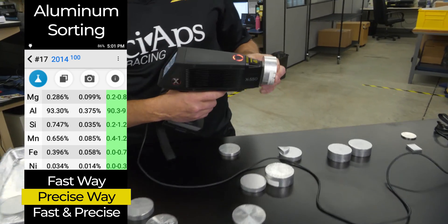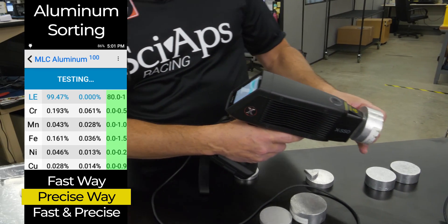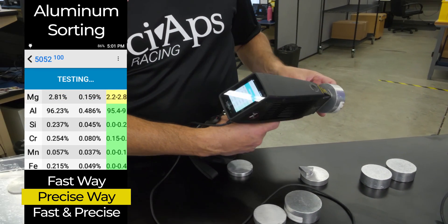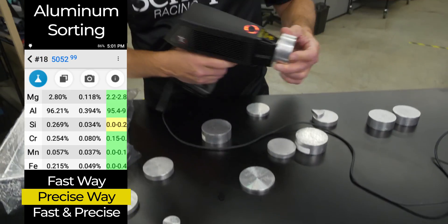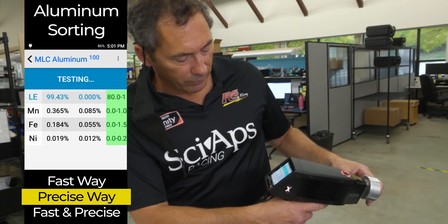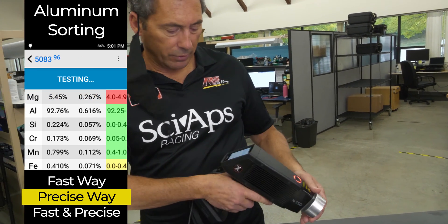We also talked about doing the 5000-series. If you don't mind a few more seconds, it only takes about an extra second to see the 2% magnesium in a 5052 — and you're done. The higher you go in magnesium, the faster it is. Here's a 5083 — comes right up: 5083, about 5% magnesium.